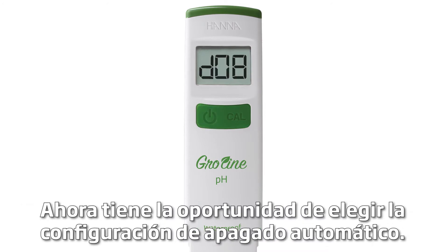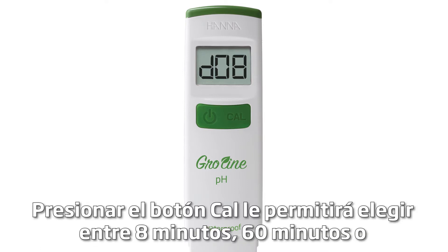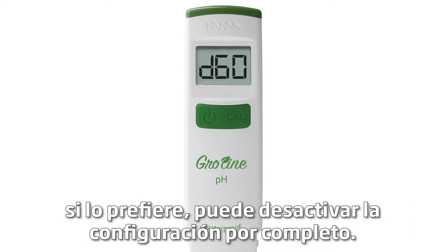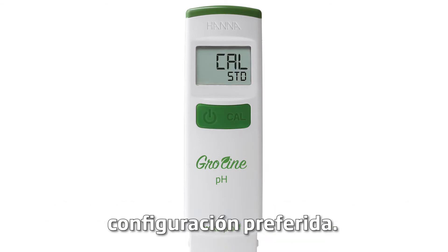You are now given the chance to change your Auto-Off settings. Pressing the Cal button will let you choose between 8 minutes, 60 minutes, or if you prefer, you can turn the setting off completely. Press the On-Off button once you have your preferred setting.